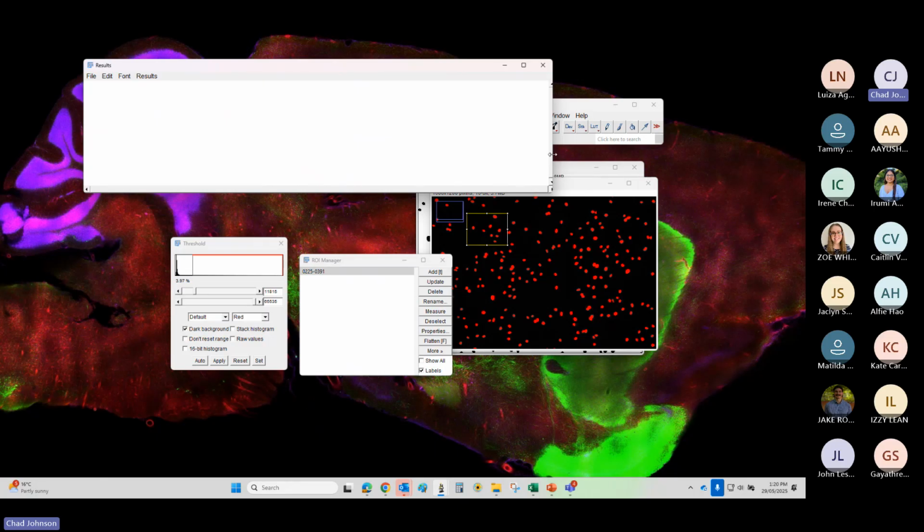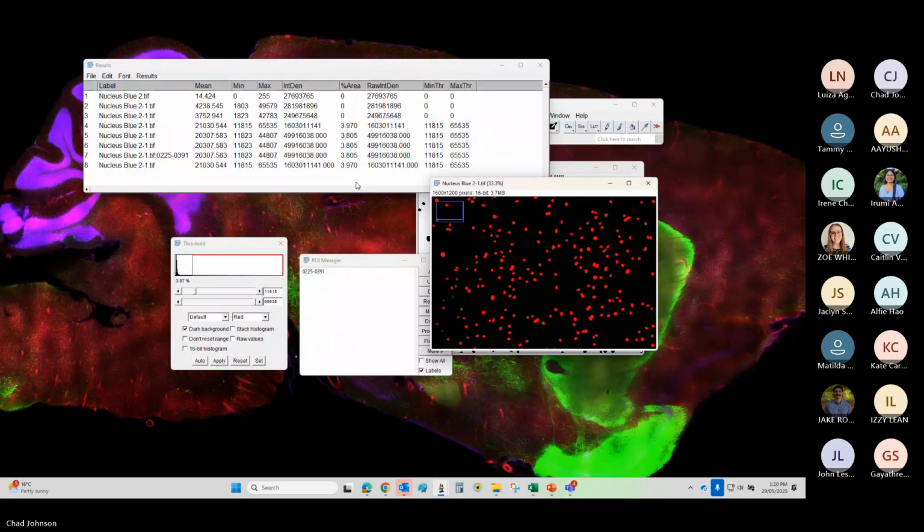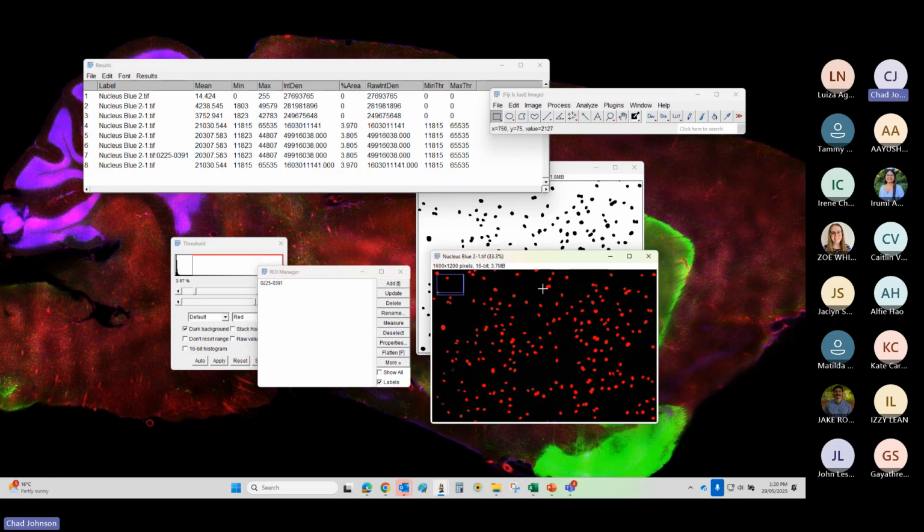And now, why is that doing that? It should be giving me a different value. Sorry, I'm just not sure why that's doing that. It should be giving me a different value.